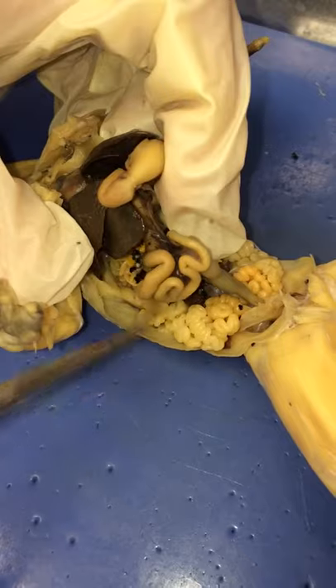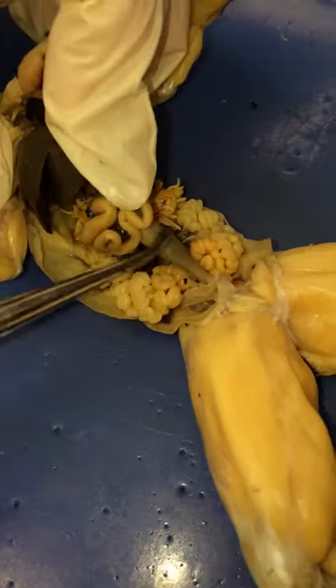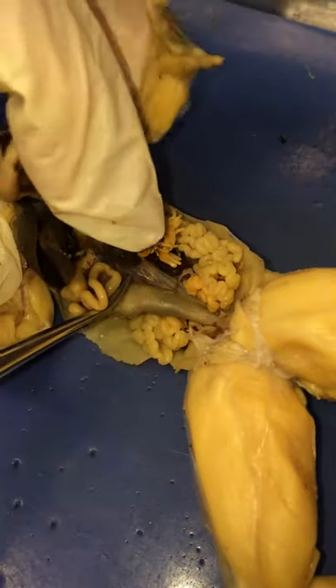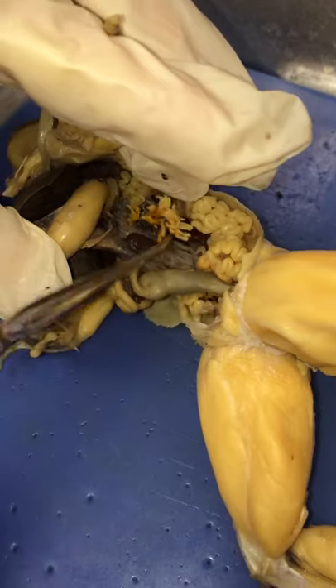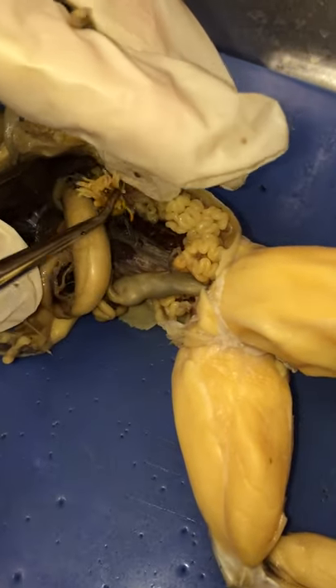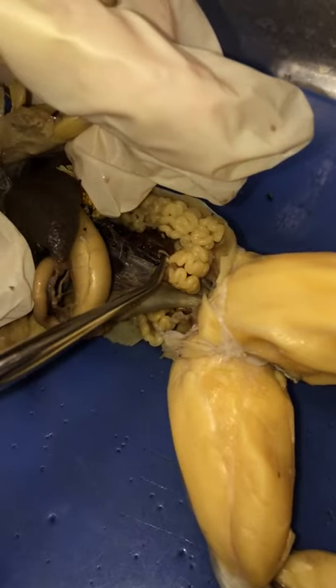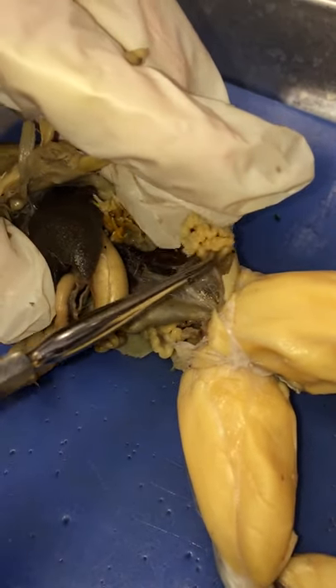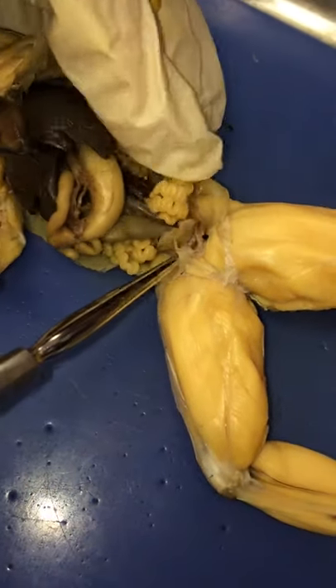All this is small intestine, with the large intestine down here on this side. This little bean-like structure is the spleen. If you move some of these fat bodies aside, you'll see the kidney. These are all oviducts and they could be cut out and removed as well. Here's the bladder — it's this sac right here.